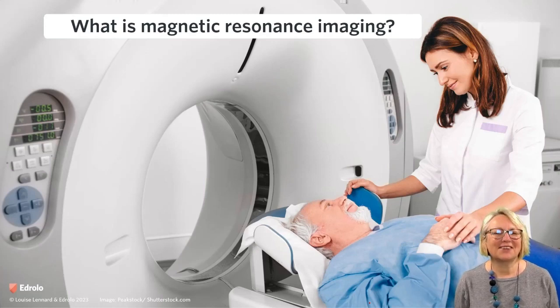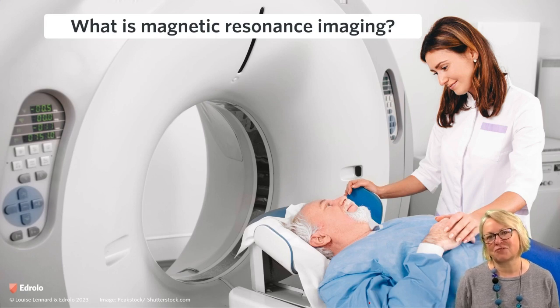Welcome back. I don't know how many of you have had an MRI before. MRI stands for magnetic resonance imaging. It's a non-invasive spectroscopic technique using radio waves to spin flip odd number of nuclei under a strong magnetic field. The person lies on a bed that moves into the MRI machine, surrounded by a strong magnet. And the images obtained can be interpreted by a doctor or a medical professional for diagnosis of certain conditions.